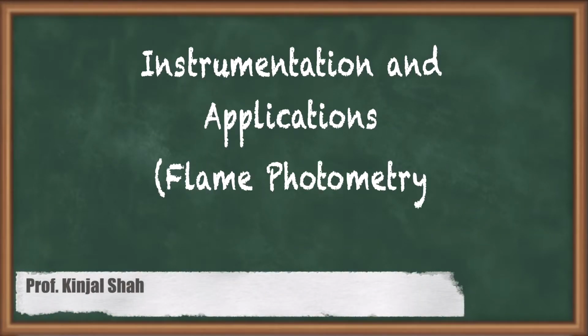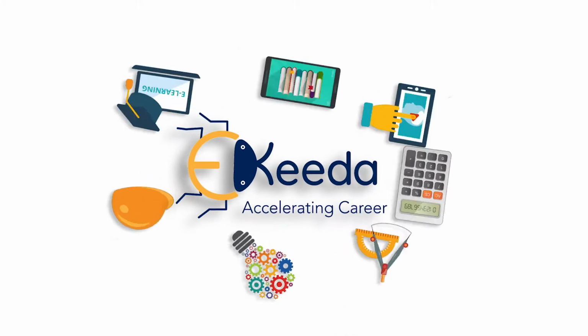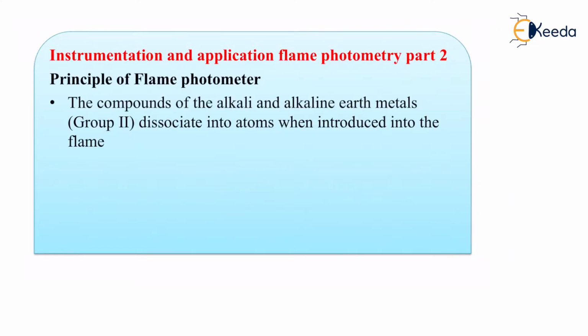Hello students, over here we are going to study the application and the instrumentation process of flame photometry in a little more depth. The first thing we'll study is the principle of the photometer. Now what is the principle of a flame photometer?